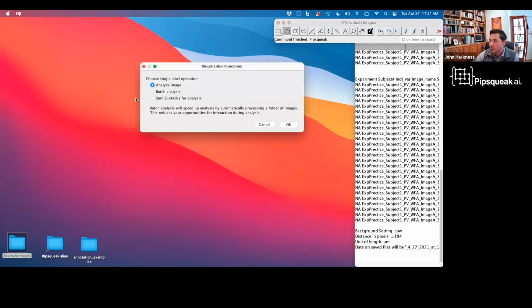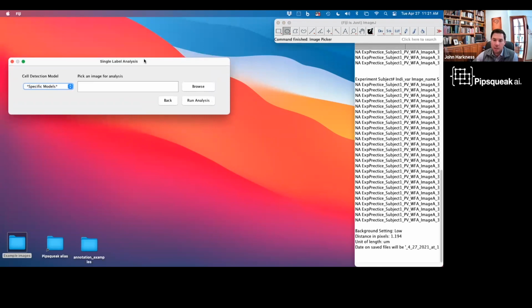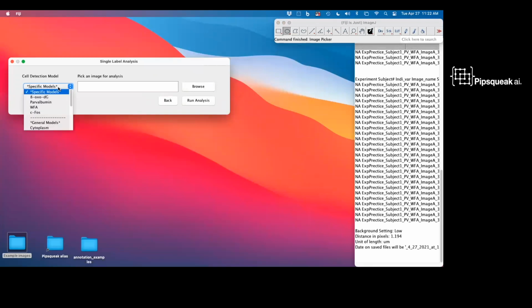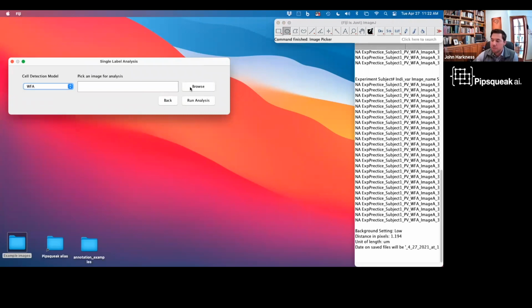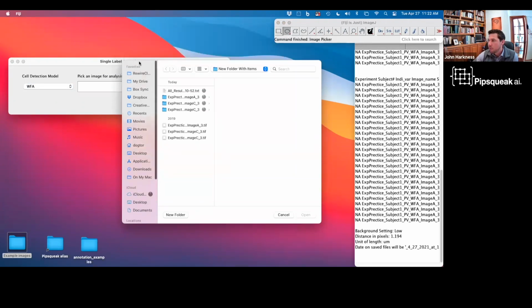One of the things that we've enabled is to analyze images that have both bright and dark backgrounds. With both threshold analysis and with AI analysis or detection, one of the things that becomes difficult is looking at cells that might be stained with a more typical IHC process rather than immunofluorescence. Because we might be seeing that the cell is dark on a bright background, and so that can be difficult for AI.